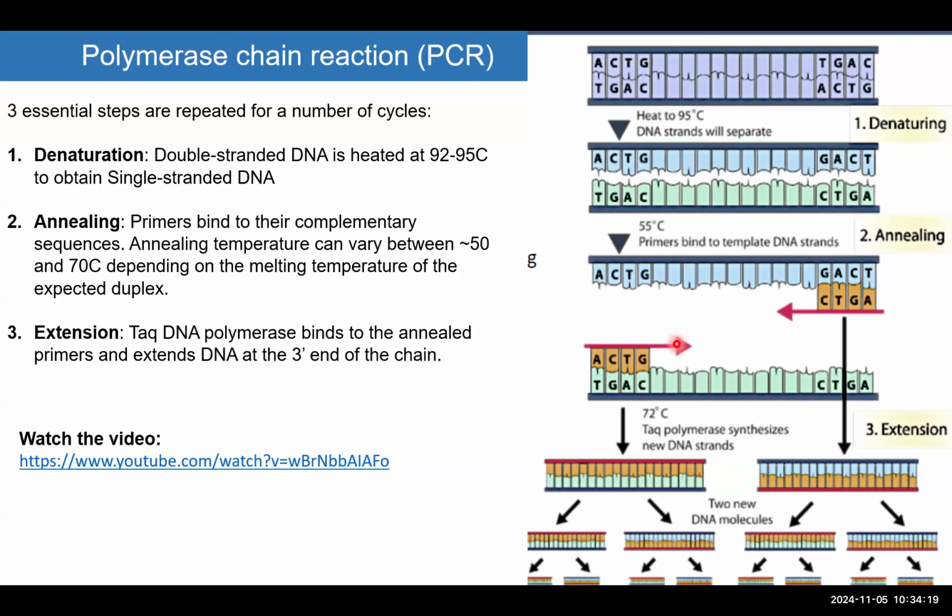And we need a thermocycler because we're working in a lab, so we have to increase the temperature to 95 degrees to ensure denaturing. And then we do an annealing step so that the primers bind. And then after that, with the Taq polymerase and the dNTPs, the process of polymerization takes place. And we do this for many cycles, normally up to 30 cycles. It depends on the experimental setup.